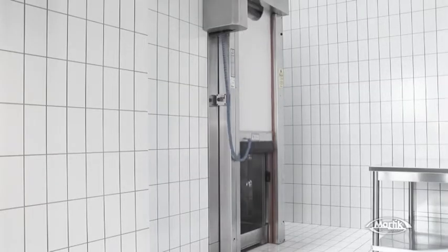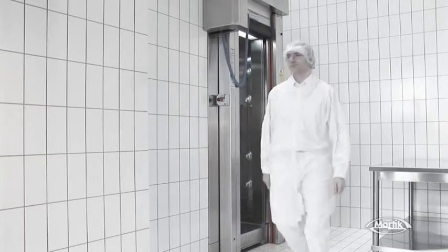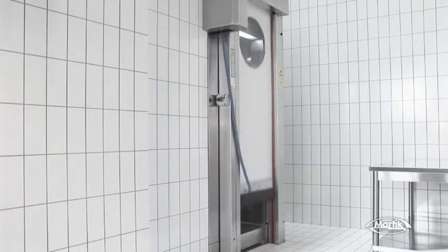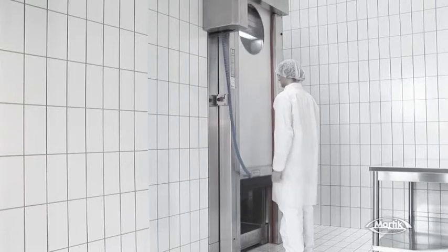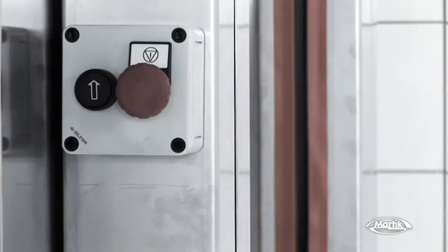After the cleaning step, the door rolls up automatically, letting you out. When the roll-up door closes, Airtek self-cleaning starts. Finally, going out of the clean room, you only have to press a button on the door side to get into the air unit.